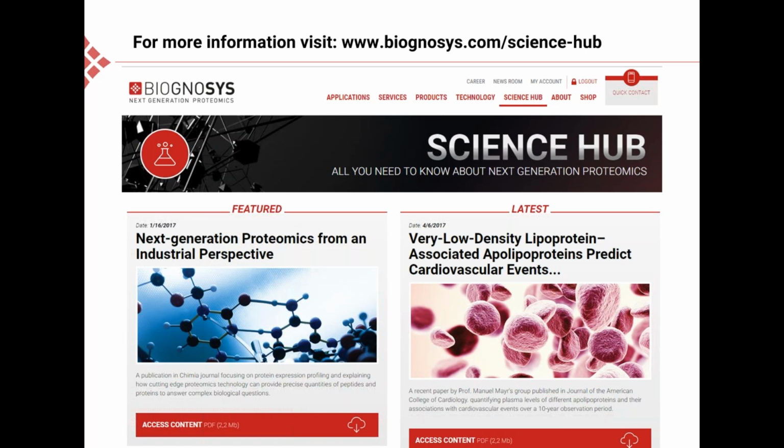The next question is about the statistical analysis that SpectroDive is doing. Yeah. SpectroDive, as in SpectroNaut, is doing a pairwise t-test to test for differential abundance.